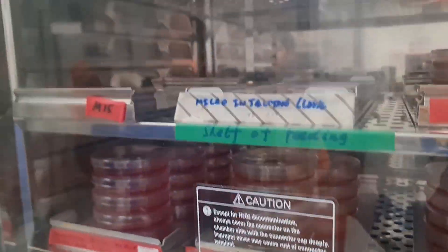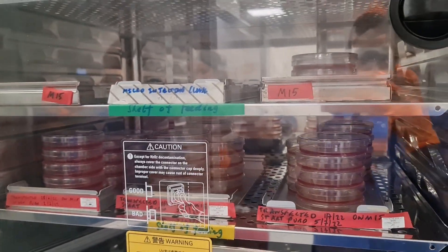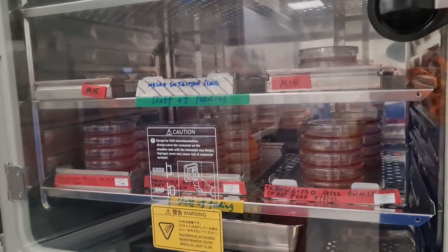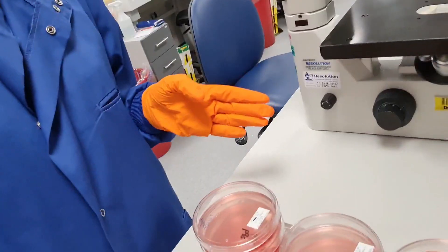These are all the cells that need their media changed. I'm going to take them out one by one because some of them require slightly different media supplements. These cells here have been transfected recently and after a couple of days we need to do a drug selection — so we'll be adding puromycin to select for the correctly transfected cells. I'm just going to check if they're all still looking healthy and alive before I change the media, just in case.